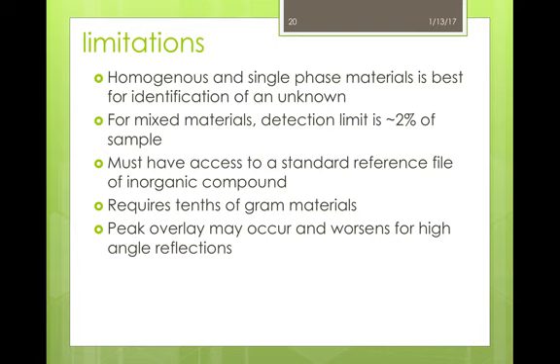Like any machine, there are limitations. To get the best results, a homogeneous sample with a single phase can be analyzed. For composites or mixed materials, the limit of detection is about 2%. So if there are any elements present that make up less than 2% of the sample, they cannot be detected. Once a profile peak is collected, there must also be a reference file in order to identify what that material is based on that profile. Fortunately, there are such reference libraries at our center.